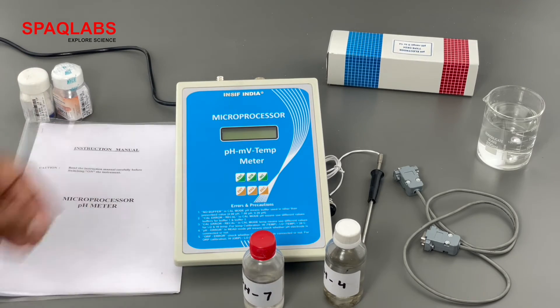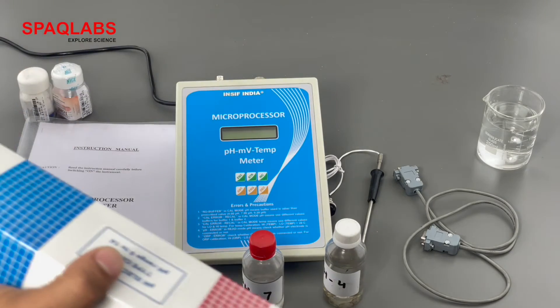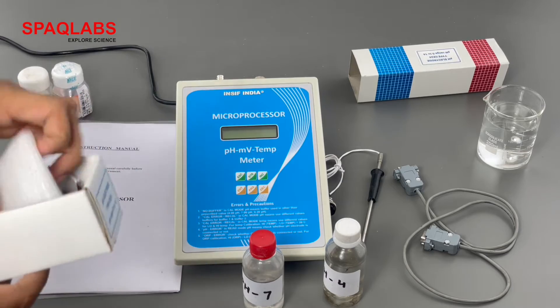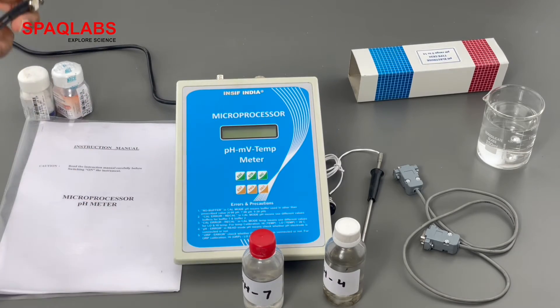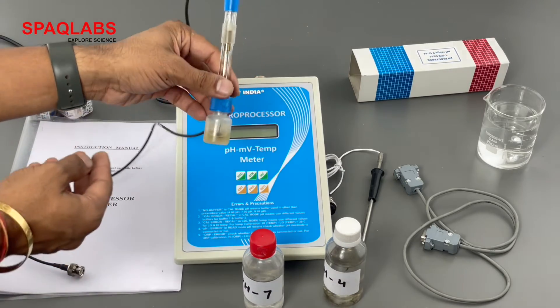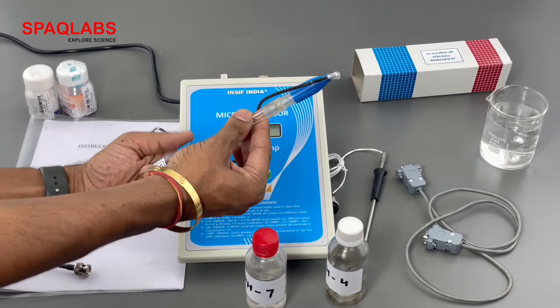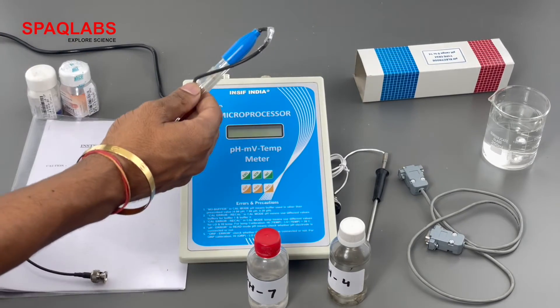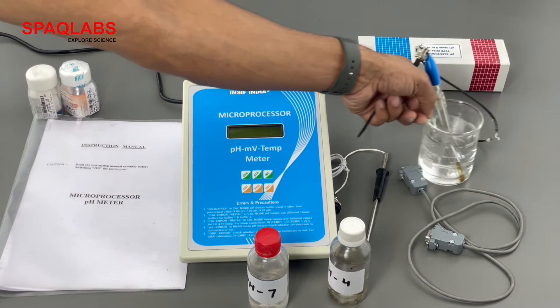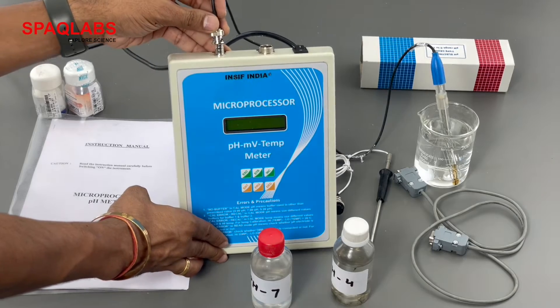Now we are going to see how to use this microprocessor pH meter. This is the pH electrode. Make sure it is dipped in the liquid. Place it in a beaker with clear water.